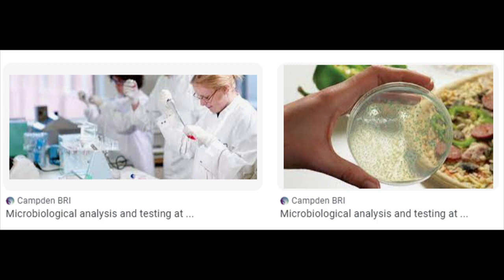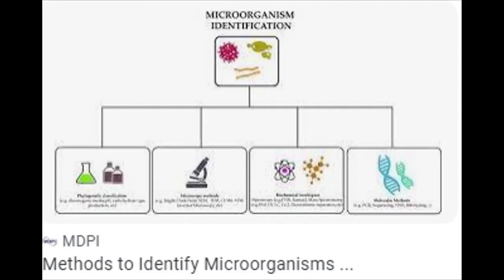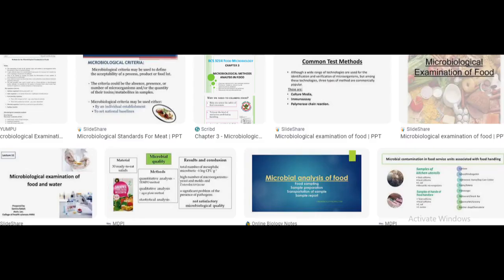So you put the food of the microorganism in the plate, you pour it out as the agar, nutrient agar or potato dextrose agar, depending on the type of microorganism. After you have put the food inside, the food will have been heated up. When you see it molten, in liquid form, you pour it. When it's cold, it will solidify. So on top of that solidified agar, the microorganism will now be put. Then you cover it, and then you incubate it.